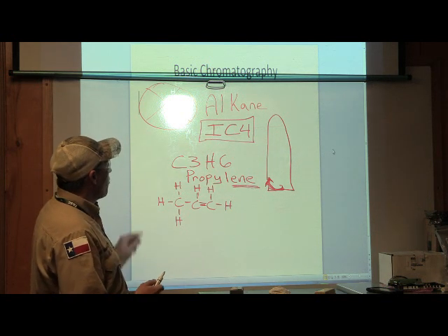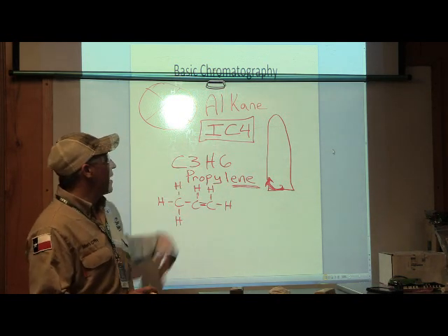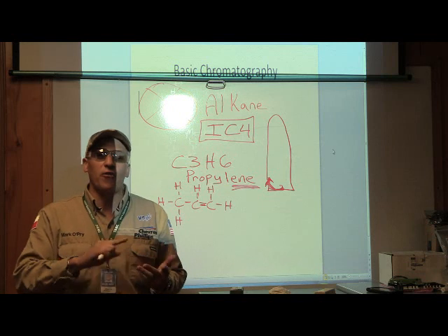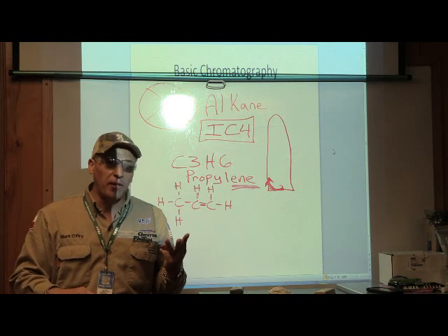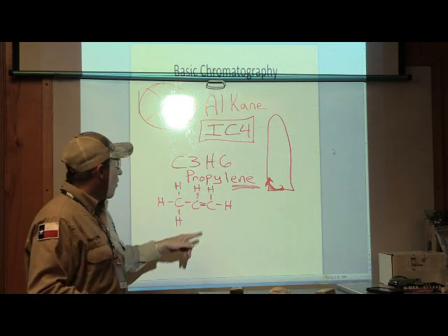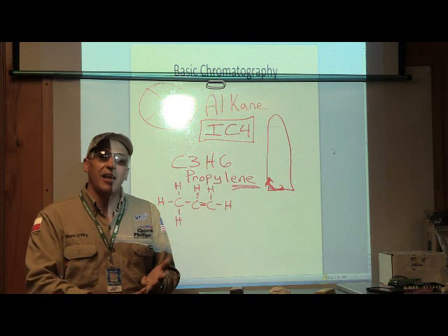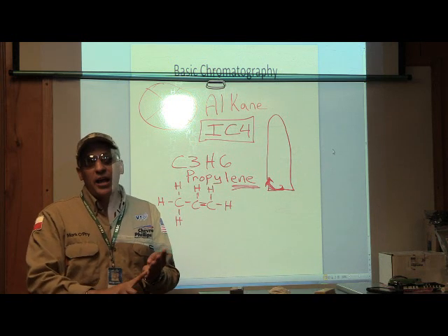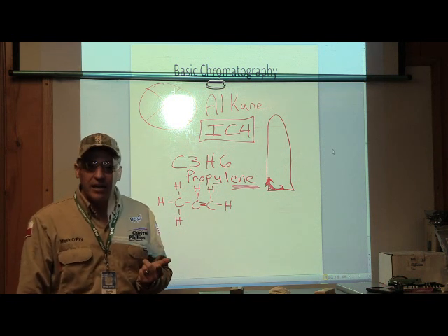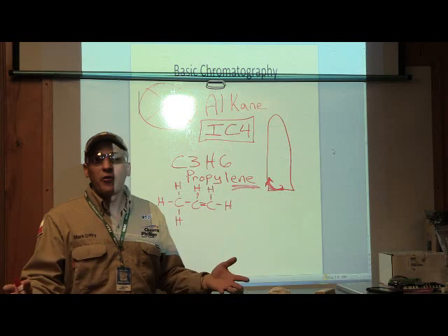Now, I think we are pretty good here on the alkane versus the alkene family. Another word that you will hear on the ship channel is HRVOC, highly reactive volatile organic carbons or compounds. You can say it either way. But the HR ones are the double bond guys. Those are ethylene, propylene, acetylene, butene 1, isobutylene, 1,3-butadiene, trans 2 and cis 2 butene. You look for those in your HRVOC. Your plant probably doesn't have a whole bunch of that stuff, but they're going to look for it anyway.